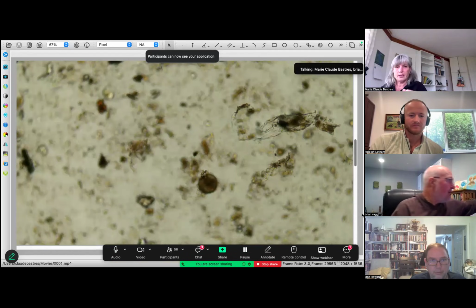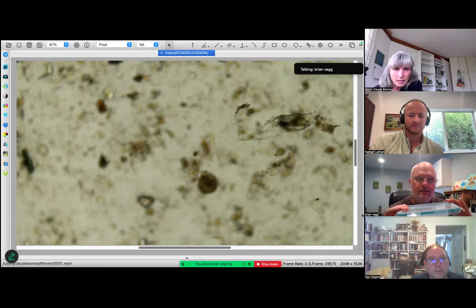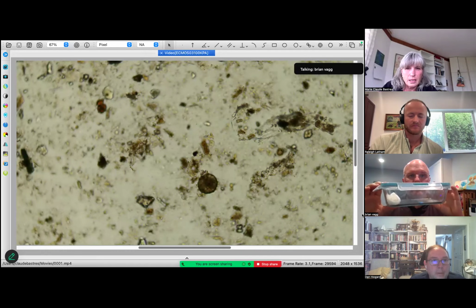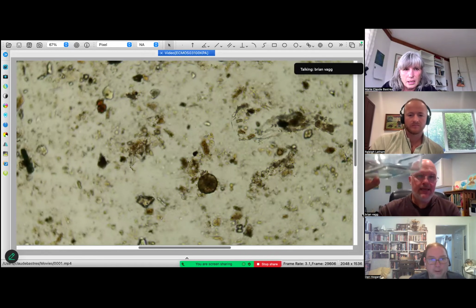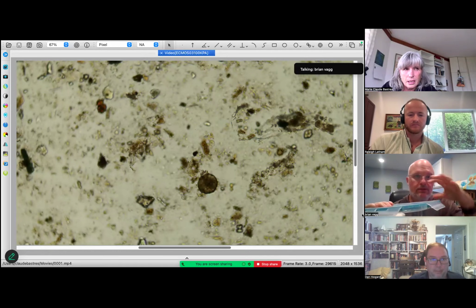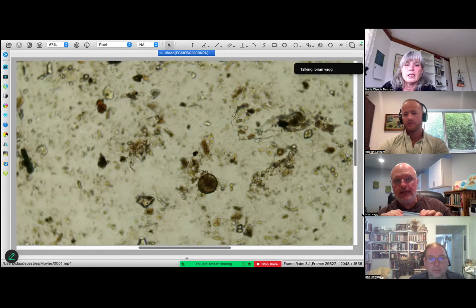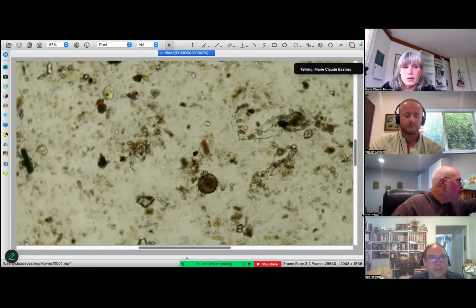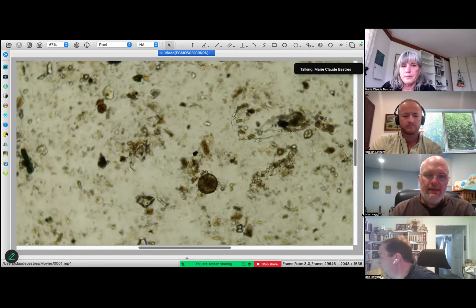While you're doing that, I'll give everybody a little bit of a tip. If you ever want to keep your slides, especially if you live in a dry environment or use air conditioning, I just have a glass lock container with a wet paper towel in it, and I put my slides in the container. When I'm not using them, I put them back into this chamber, and it keeps a nice amount of humidity. You can get the slides to last for a couple of hours that way. Wow, great tip. Yeah, no problem.